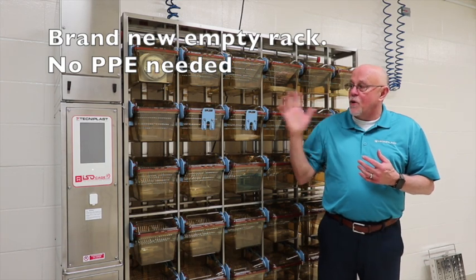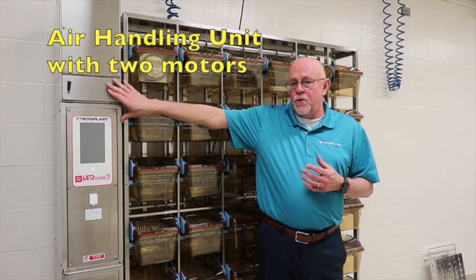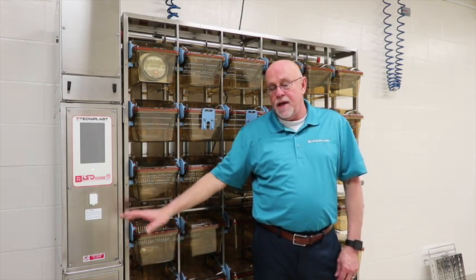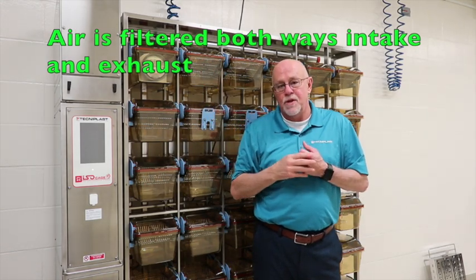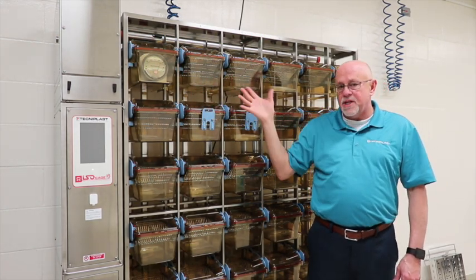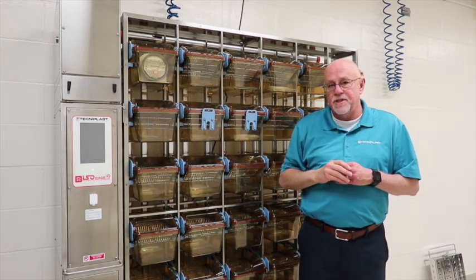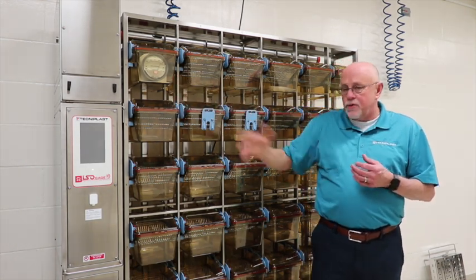The first part I want to discuss is the overview of the ISOCAD and how the system works. You have an air handling unit with two motors supplying both pre- and HEPA-filtered air out to the rack. Air returning to the air handling unit is both pre- and HEPA-filtered before it is exhausted into the room or into the house exhaust. This rack is an ISO 36, so there are 36 cages, but only 35 can be used because one cage always has our magnetic gauge showing the actual pressure inside the cage. We are running at 80 pascals of pressure to the 36 cages.